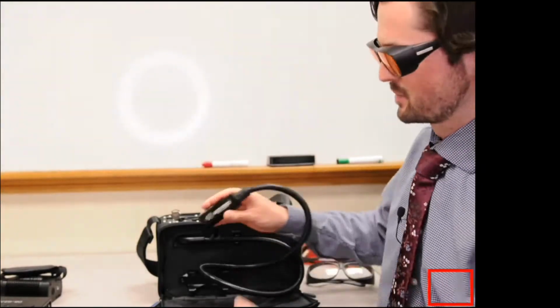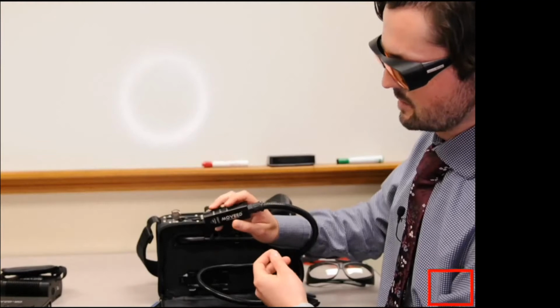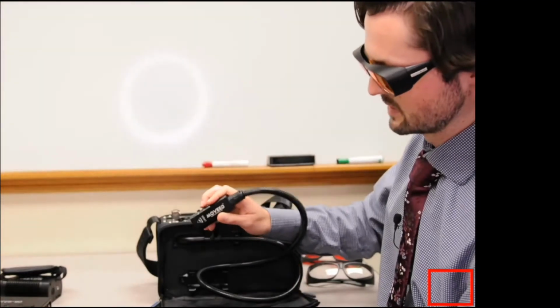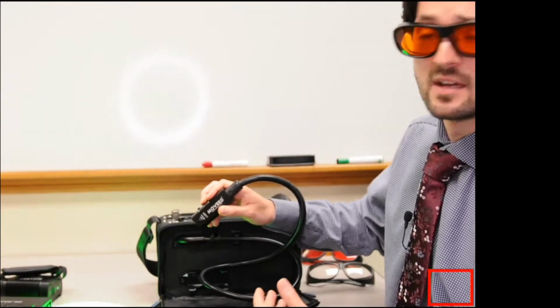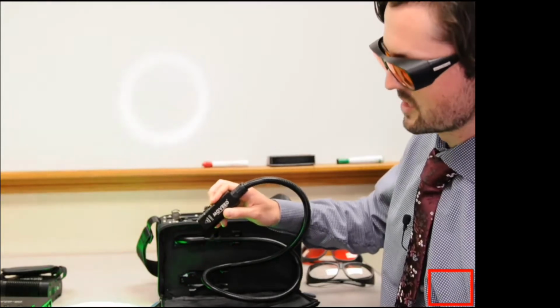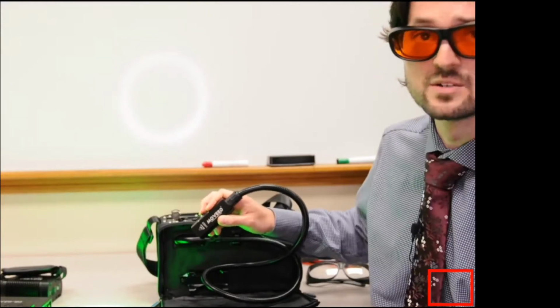So the laser is powered up, but again, we're not emitting light. And then what you do is you just simply hold down the select button. It activates it, then hold down the up button. And then you can actually increase or decrease the intensity that you're interested in. And so then this is our green excitation. For when it's dimmer, I can just hit down. For when it's brighter, I can hit up. Very easy to work with.